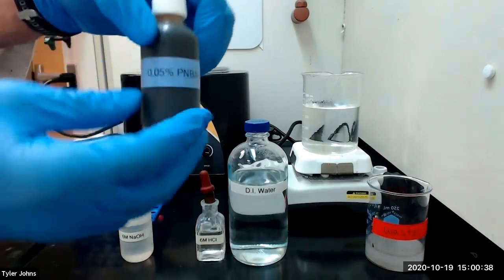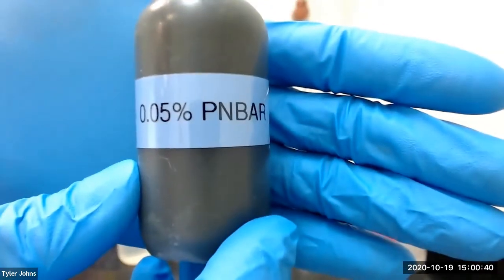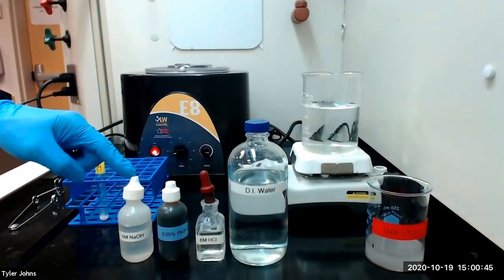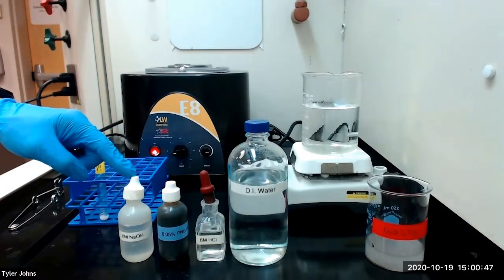We will then add 1 drop of magnesium reagent. We will then make the solution alkaline with the addition of 6 molar sodium hydroxide.